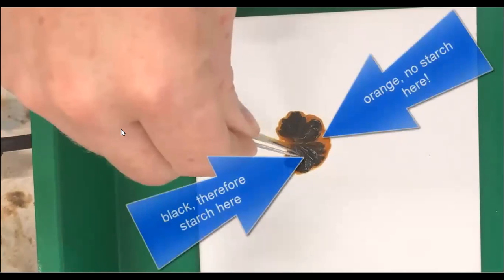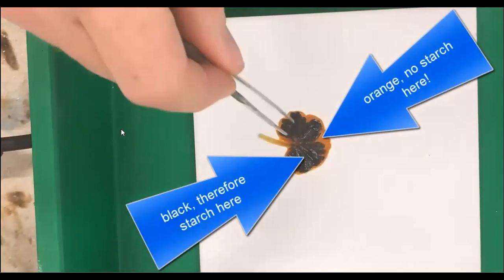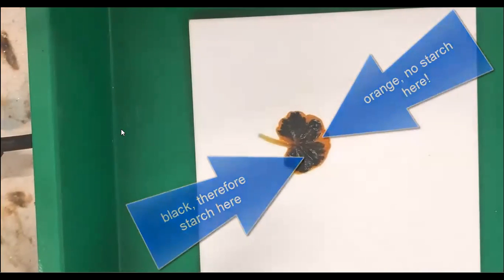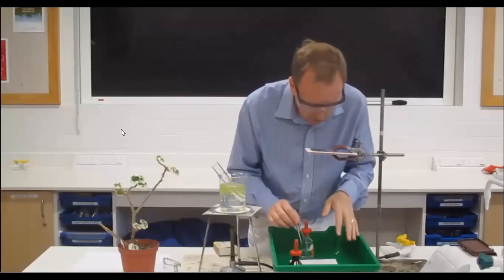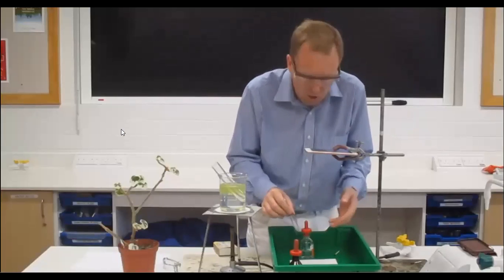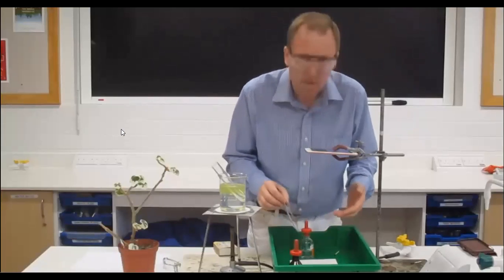The black areas are where the starch is, and also they correspond exactly to where the chlorophyll was, and therefore this is evidence. It's not proof, but it's evidence that the chlorophyll is required to make glucose, to make starch. The chlorophyll is required for photosynthesis. Thank you.